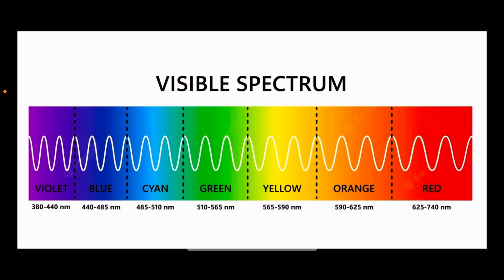Just beautiful. So what makes these different colors that we see? Well, when you heat up these different metal salts, their atoms get excited and their electrons move to an outer energy level, but they're unstable at that outer energy level, and when they return to their original energy level, each electron emits one photon. That's a particle of light, and each photon has a specific wavelength and frequency.